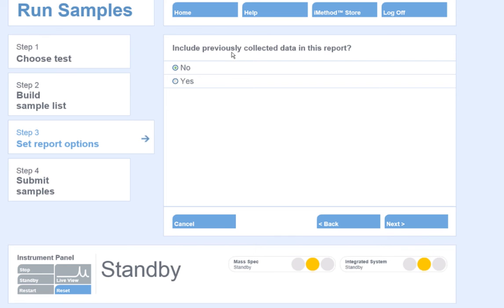If you would like to include previously collected data in the quantitation report, such as a calibration sample set collected on a previous date, click Yes to this option. In this case, I will select No.